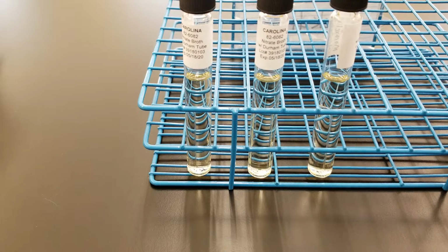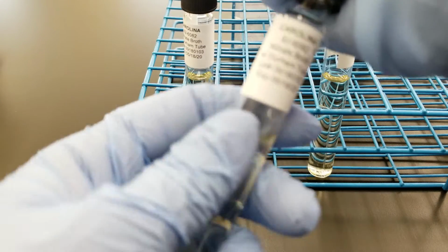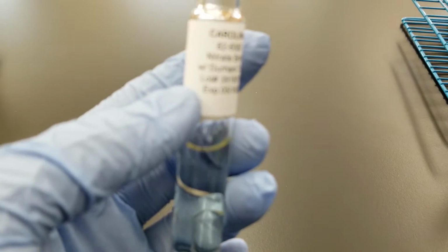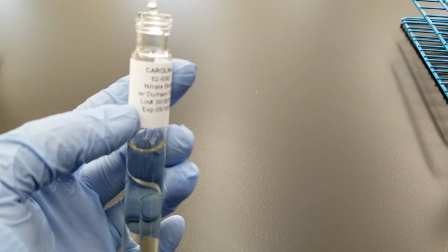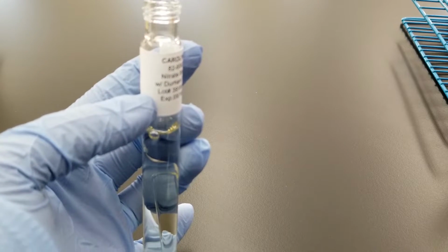Okay, so I have my pipette full here, and I'm going to put it in. We're going to do 2 drops of the, this is not focusing very well at all. 2 drops. There we go. This one had an air bubble, so 1, 2, we'll do a half of 1. Make sure we get all that.